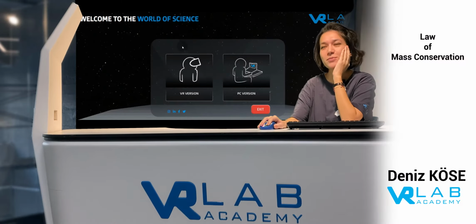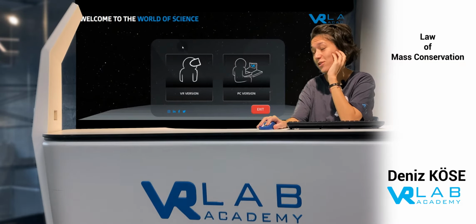Hi everybody, we are going to perform the law of mass conservation experiment.